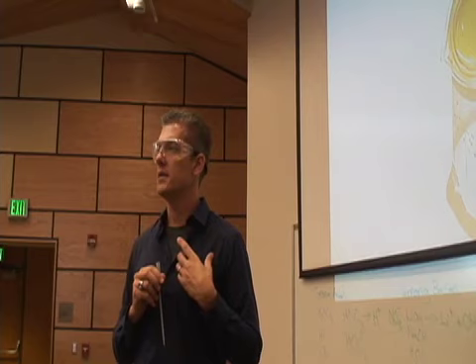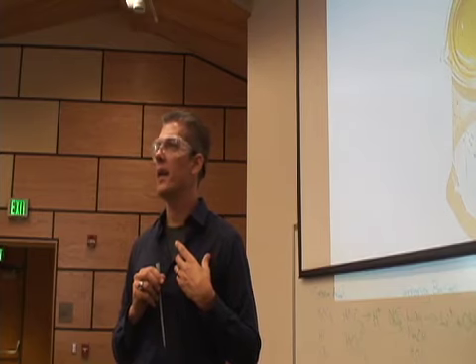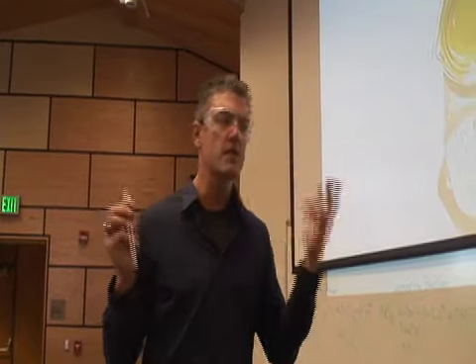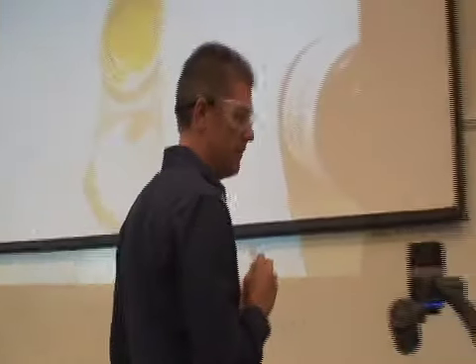Alright? So, this is the pH breath demo. It's only a subset of all the demos that we're going to do. Are you ready?